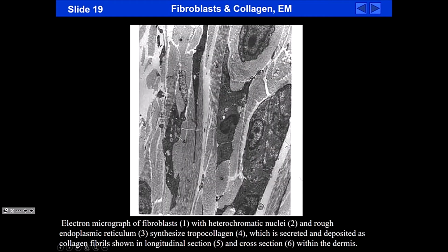Okay, so here we have some fibroblasts and collagen fibers. So the cellular material here, here's the nucleus, the cytoplasm of a fibroblast. Cytoplasm stained darker. And here you can make out the fibrous orientation in longitudinal section of type 1 collagen most likely. And in cross section, you can see the dots here, the punctate appearance in cross section again of the type 1 collagen. Yes?